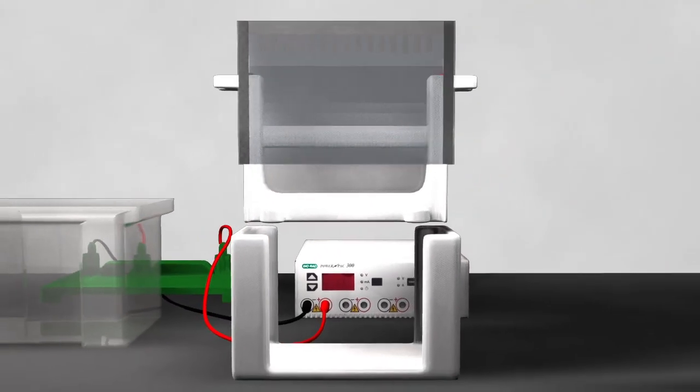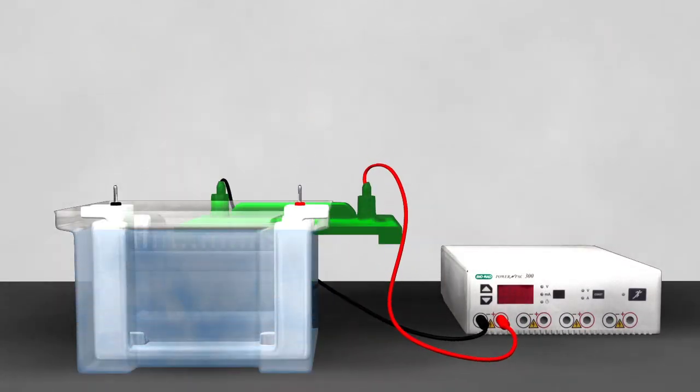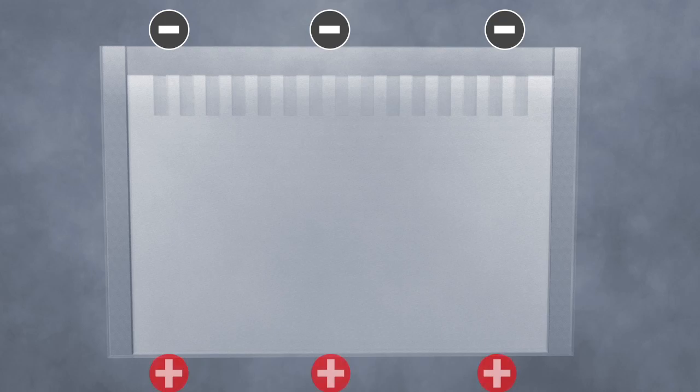Once the gel completely polymerizes, the gel cassette is inserted into a chamber, which contains buffer to allow the conduction of current through the gel, with a negative electrode positioned at the top of the gel chamber and the positive electrode positioned at the bottom of the chamber.